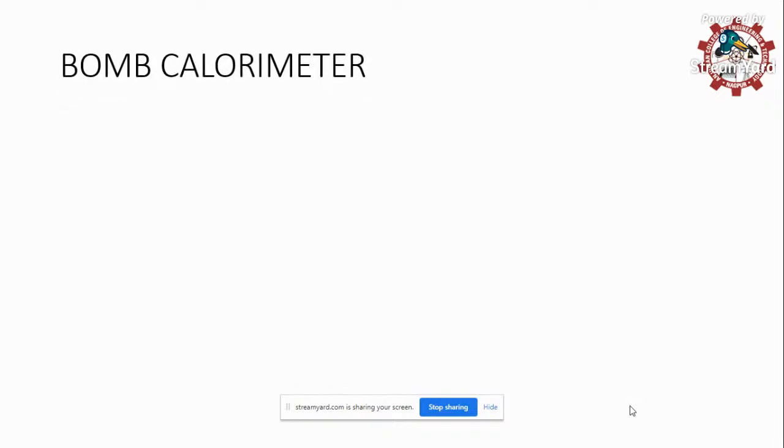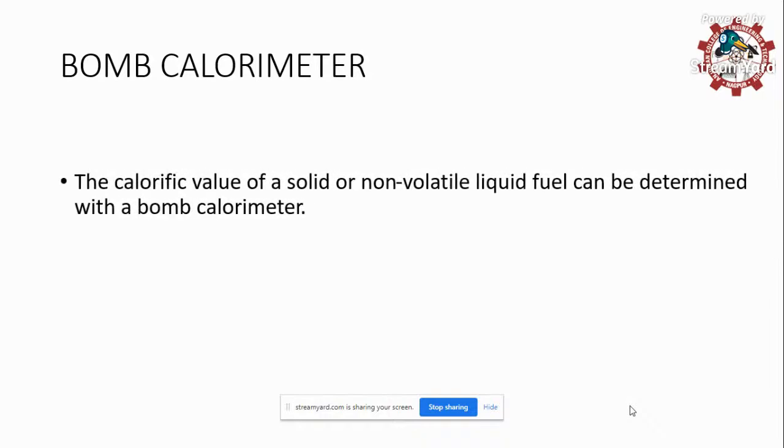Now, what is bomb calorimeter? In this topic, we'll be studying the principle, where it will be used, how it has been constructed in a simple and schematic way, the diagram, the calculation part, and the various corrections which have been incorporated here. Before starting with the word bomb calorimeter, just find out what is calorimeter. Can anyone tell me what is calorimeter? Have you heard about the term calorimeter? No one has heard? You may put your answer in the chat box. What do you mean by calorimeter? Please break the word calorimeter.